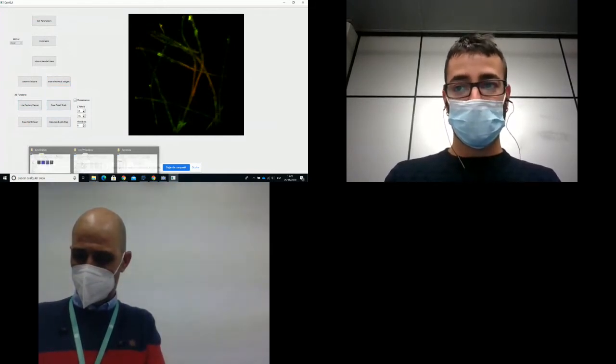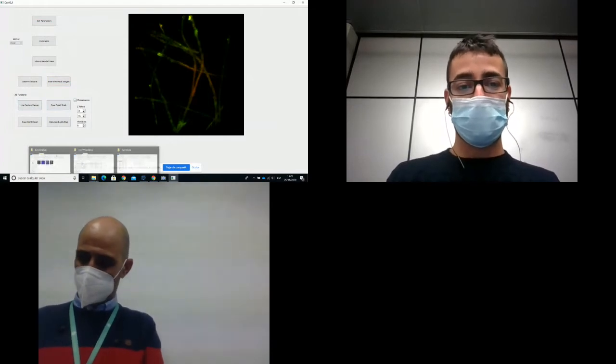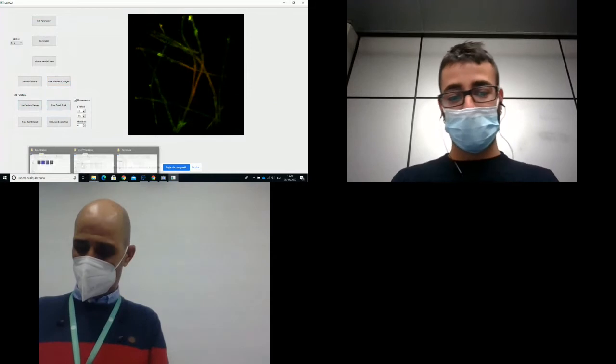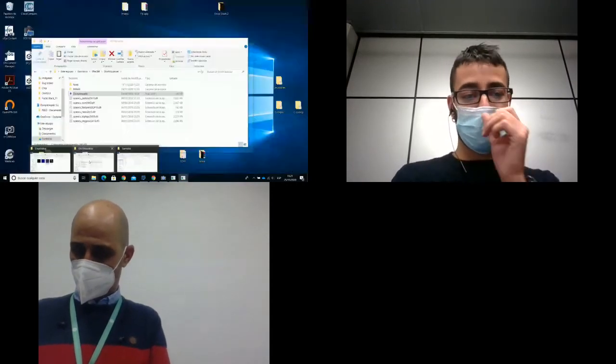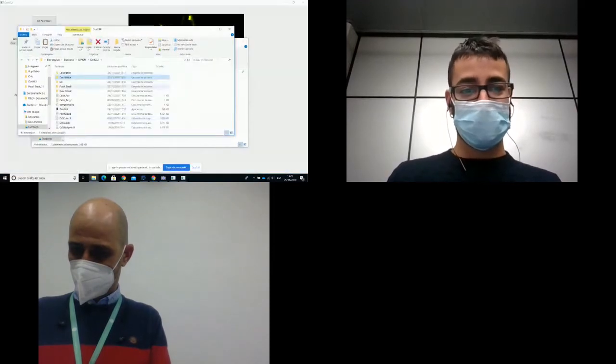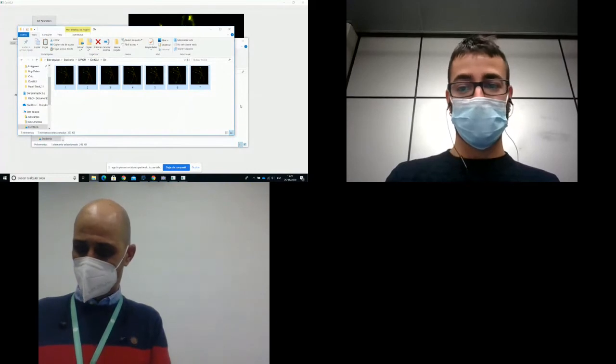Now the problem we have is that they are, let's say, two separate software, but we are integrating them to have the visualization and the processing in one single software. So here, let me just copy paste the images from one folder to another.